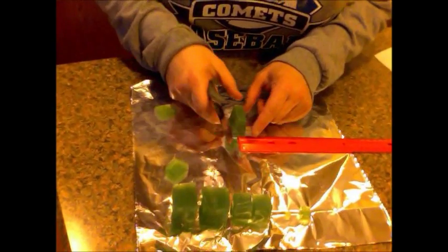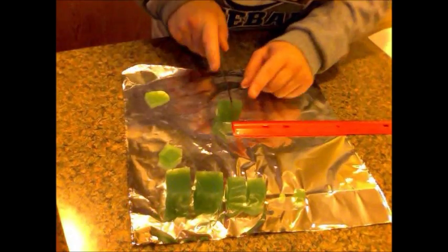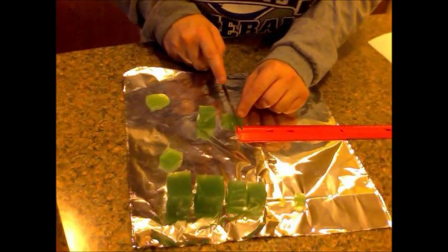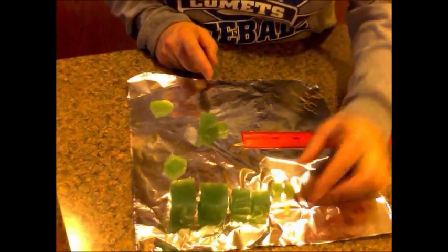Now we need to make our one centimeter block, so go ahead and line it up. It's 10 millimeters, or one centimeter. Do some trimming. There's my third block — should look very similar to that one.